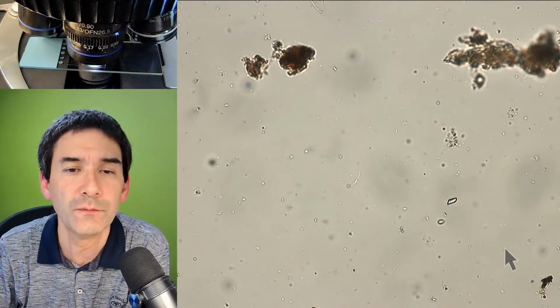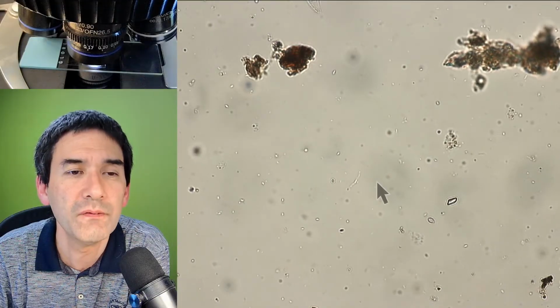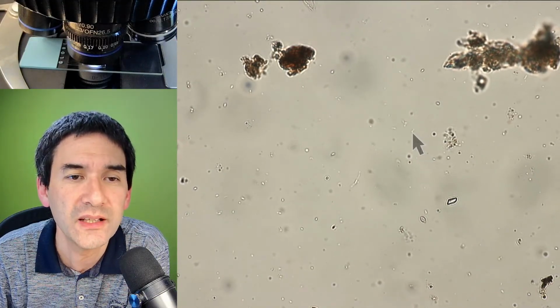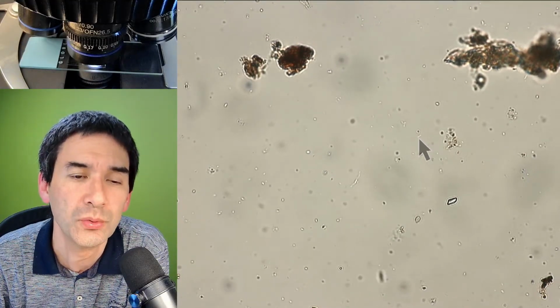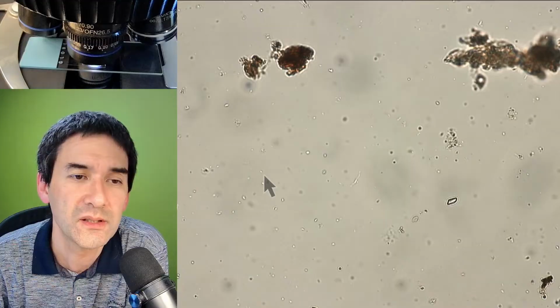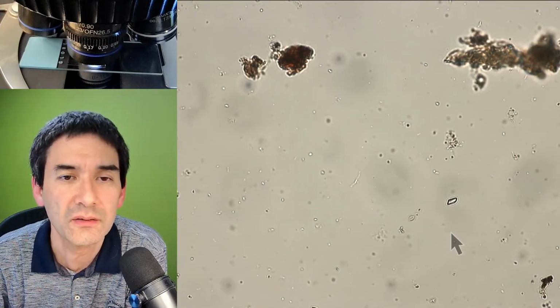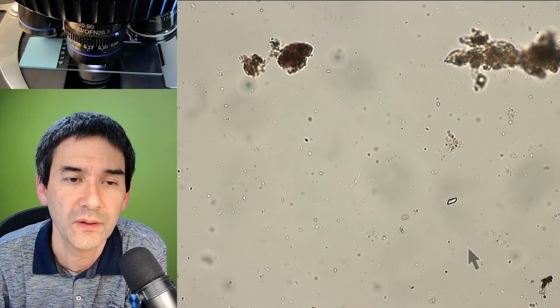If you look very carefully, some bacteria move in a very directional, non-random manner. Look at this tiny one over here. I don't know if you're able to see this. Then you know it's a bacterium that's able to move on its own, right? And you see there's some other stuff floating around here. But it is difficult to see if you don't have a microscope with good contrast.